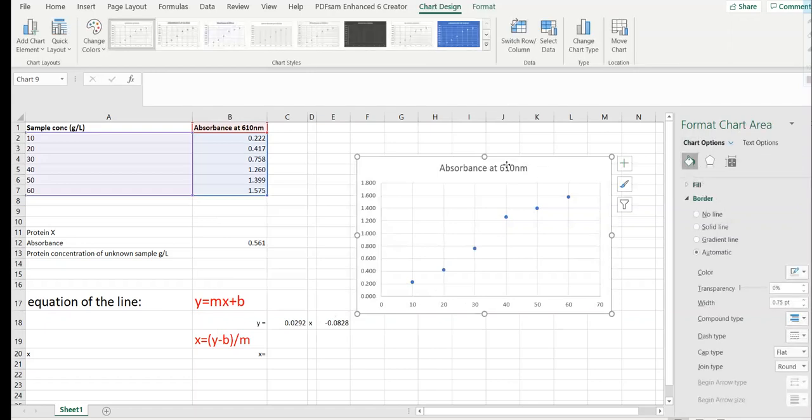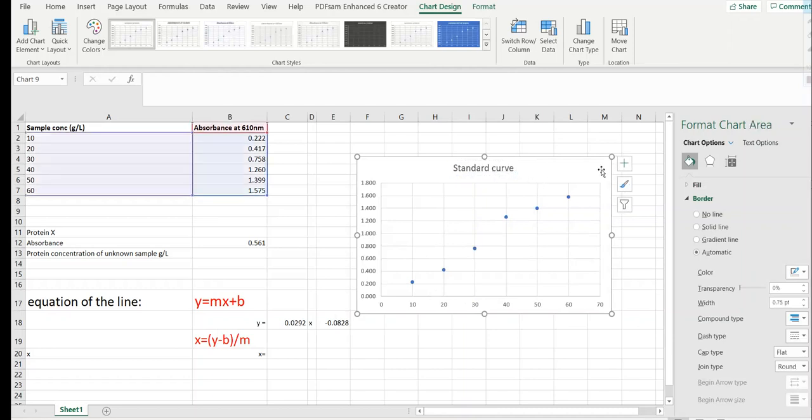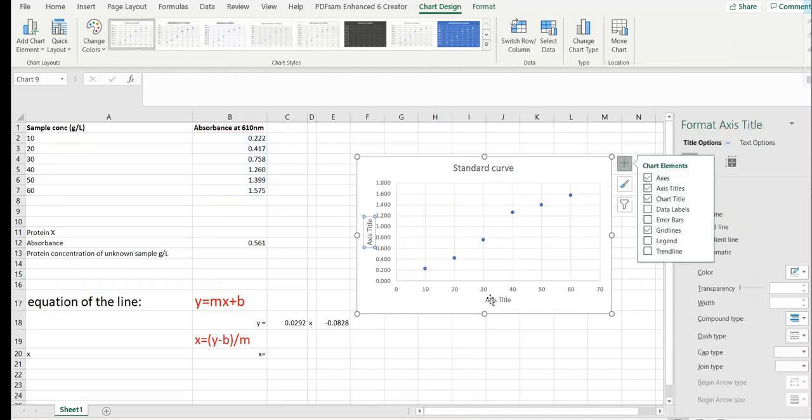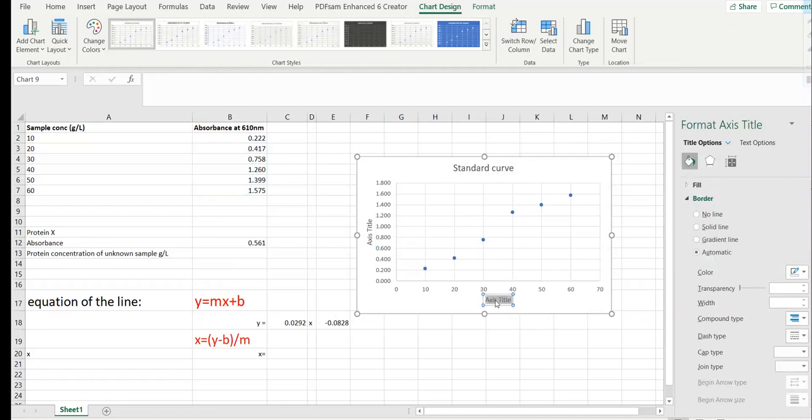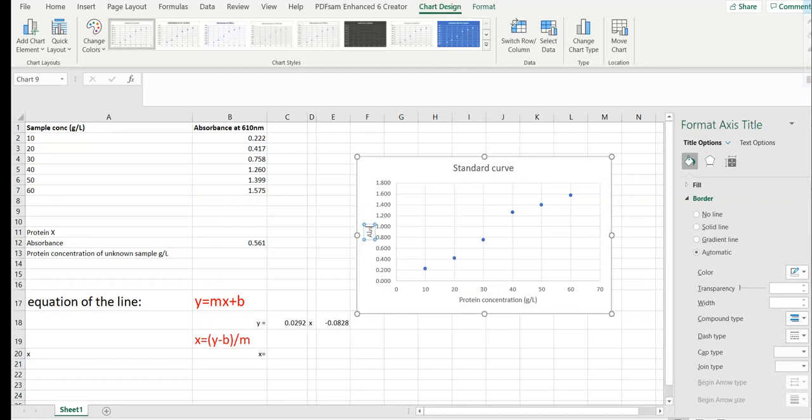So this is your standard curve. You can add the axis titles which is protein concentration in grams per liter and absorbance at 610 nm.